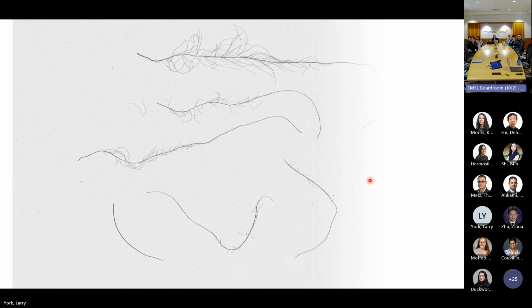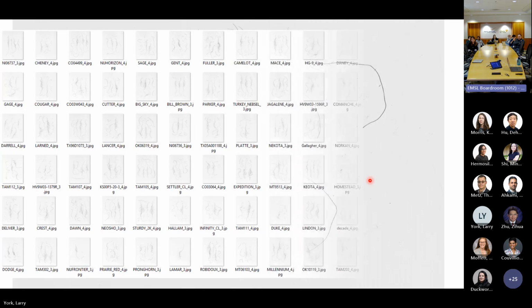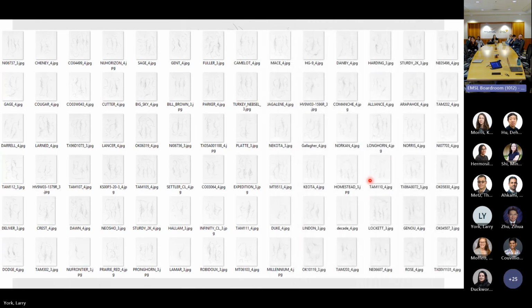For those of us who study roots a lot, the scanning method, where you wash roots out of a sample and scan them on a flatbed scanner, is one of the most common methods. I think of it as the bread and butter of root biology research. It just always works.